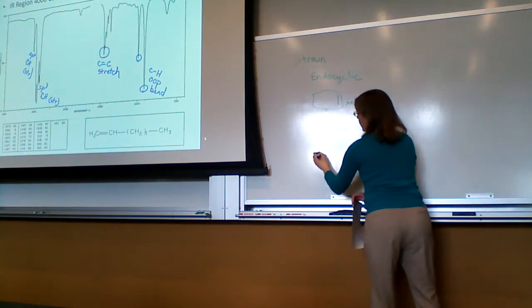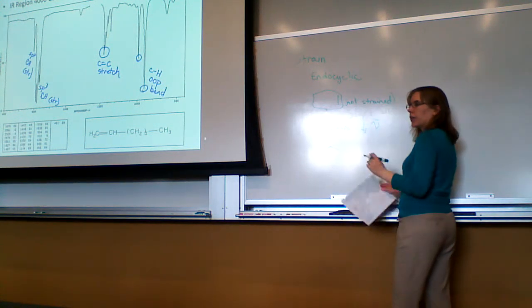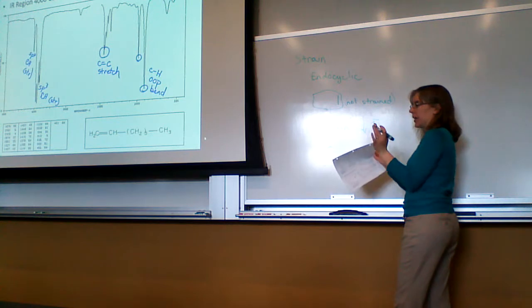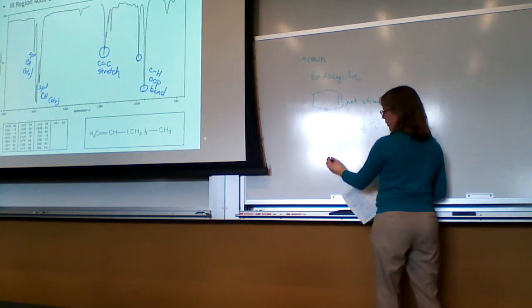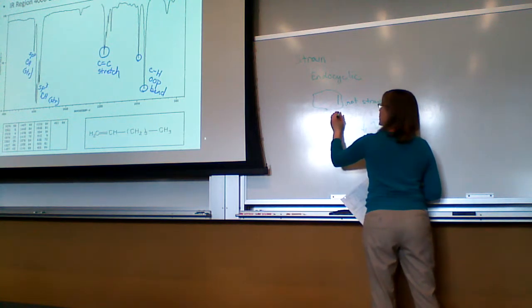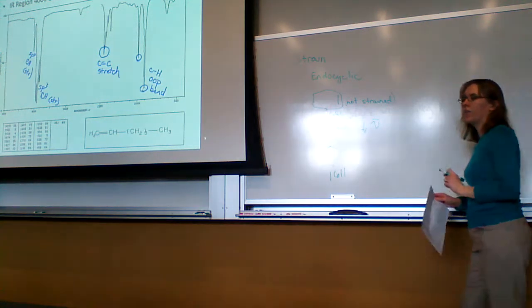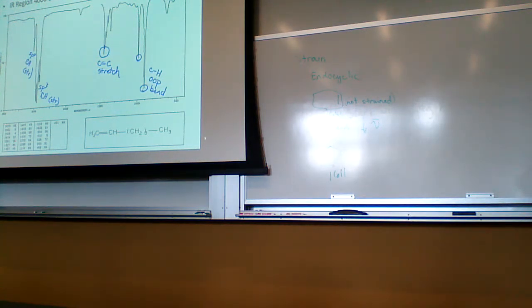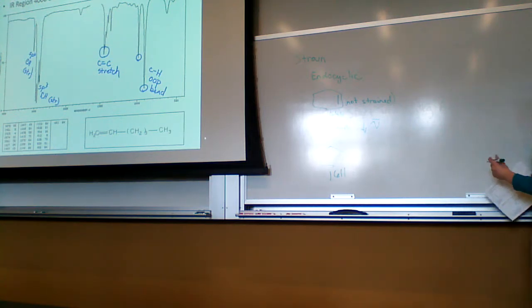But if we go to a smaller ring, you're going to start straining that double bond because it has to try and fit into the size or the bond angle inside the ring. So we go from 1646 for your standard stretching to 1611 for the one inside the ring. So that lowers it slightly, about by 30, but it's not entirely consistent.